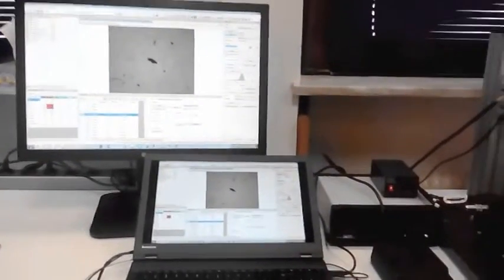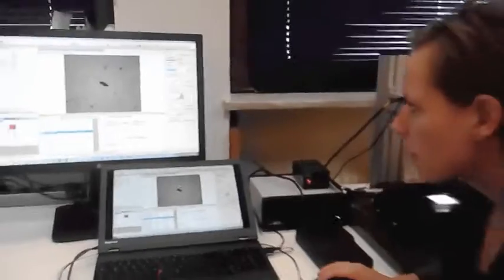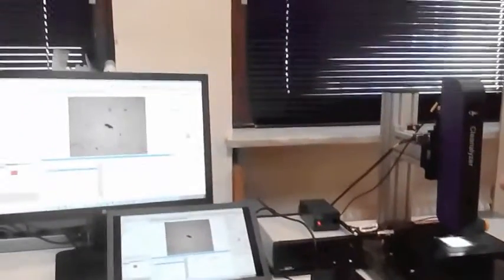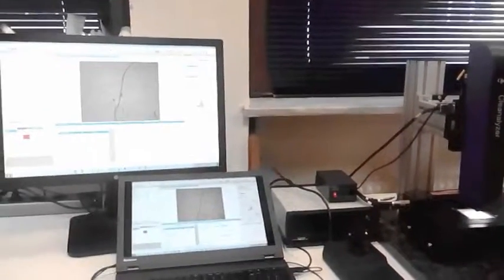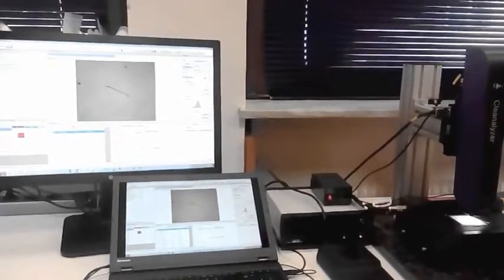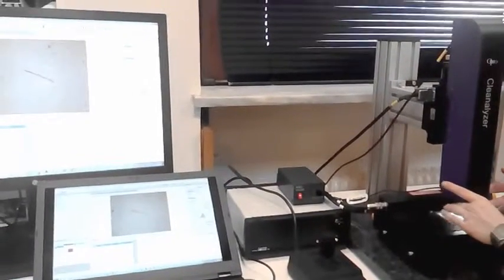Very good. So you can also check, for example, what the software is doing when it's typed as a fiber. We can check if the particle is a fiber. When we go there to the biggest one, you can see, okay, it is. You can also see if it is reflecting or not. No, it isn't.